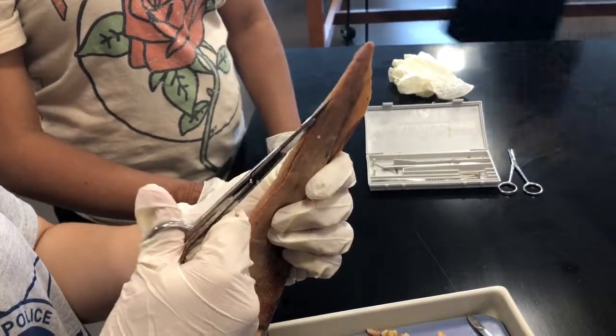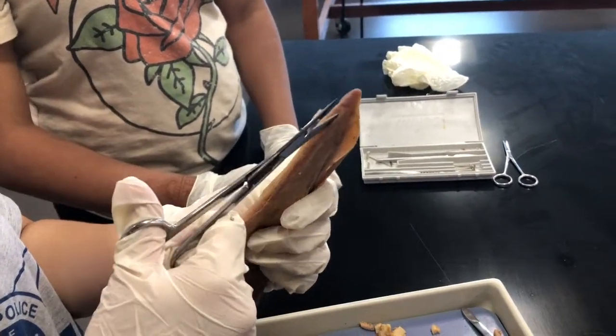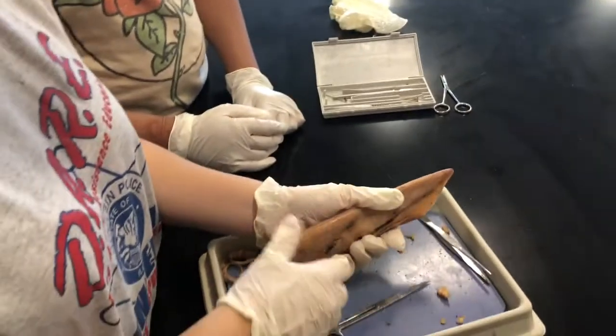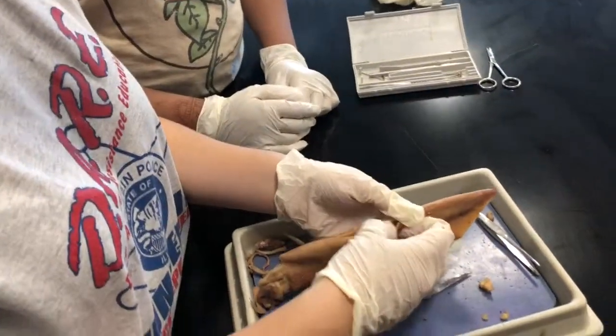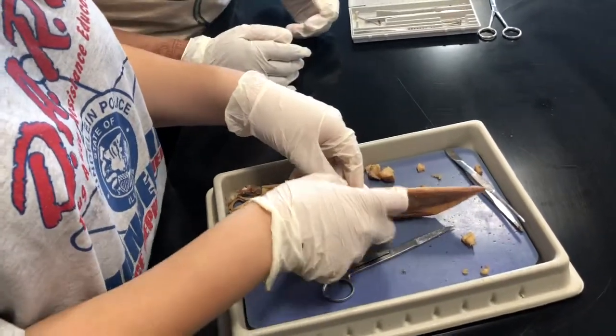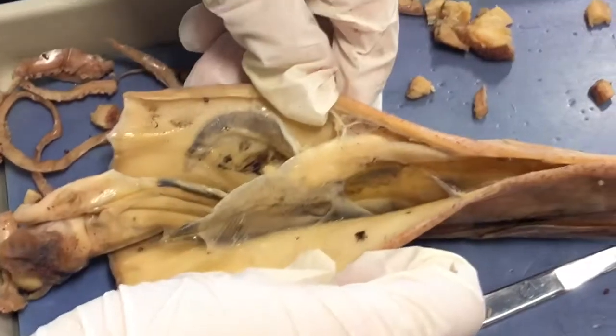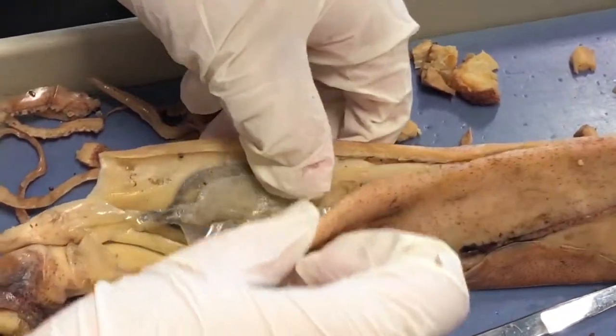The squid's adaptive features. One of them is the ink sac that aids in getting away from predators by blinding them with a thick ink so they can have enough time to get away. So, in the gills, carbon dioxide is exchanged for oxygen, and then the oxygen is carried into the tissue by the blood.